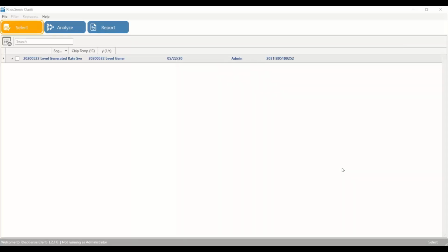Another question. So the question is, is the R squared of the quadratic fit, or the R squared of the pressure drop, the same value reported in m-VROC? It is the R squared of the pressure drop. That's a great question. Thank you.